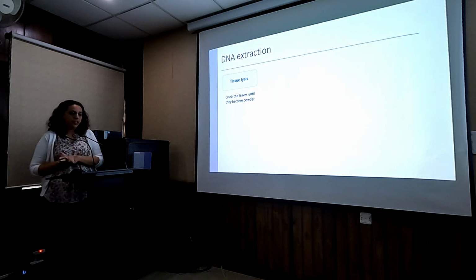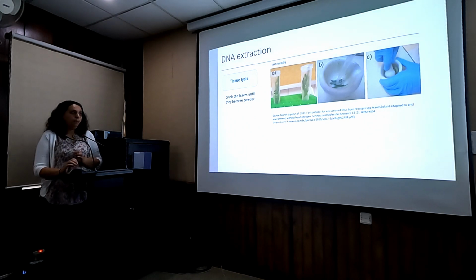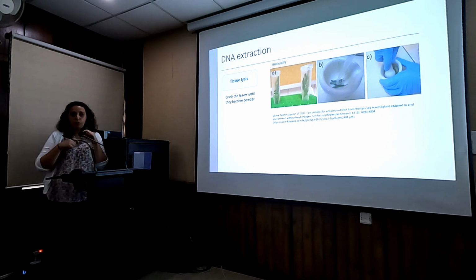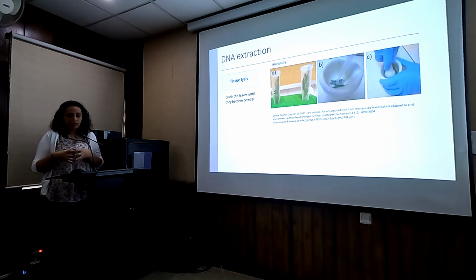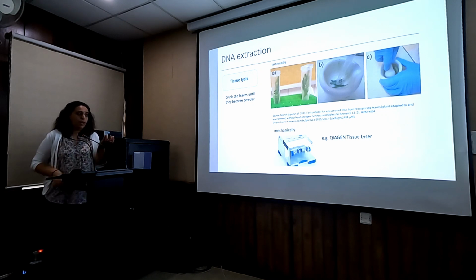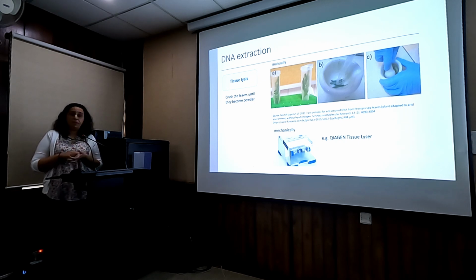So for the DNA extraction, it usually starts with crushing the leaves. You can either do it in a pestle and mortar, or you can put them in little tubes, and there are now these mini pestle and mortar things that you can use inside the tube, so you don't have to use very big equipment. So you're manually pressing the leaves to make them into powder, or you can also do it mechanically. If you have in your lab one of these automatic tissue homogenizers, it's very, very handy. You might still need to prep them manually.